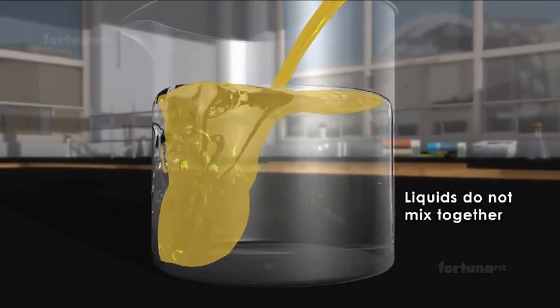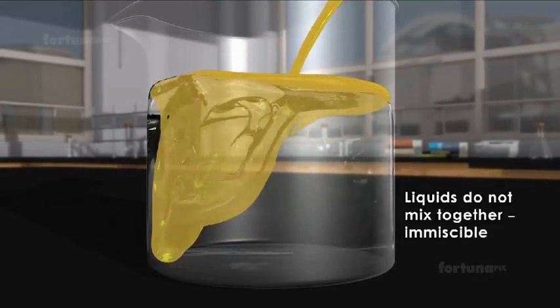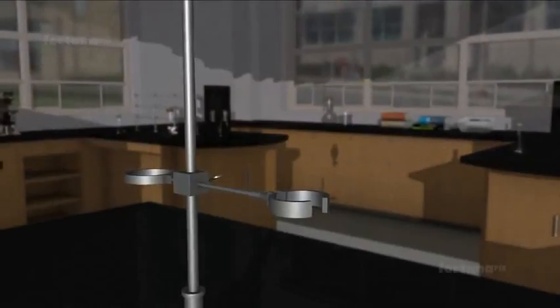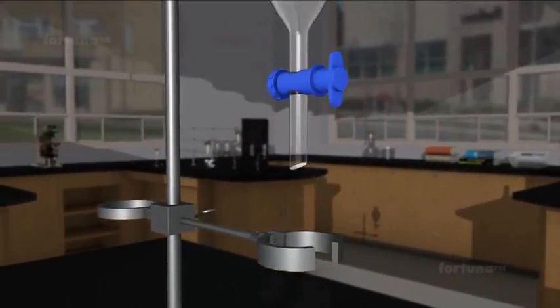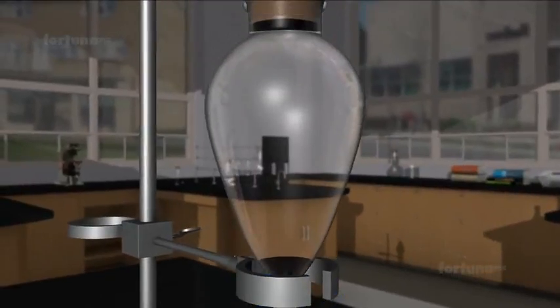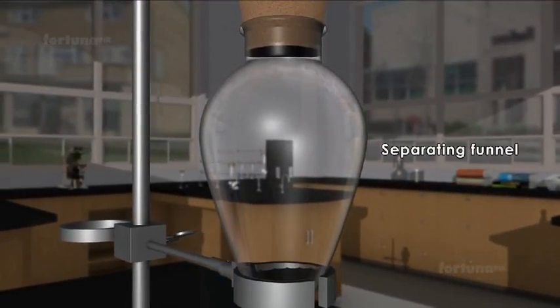and form a homogeneous mixture, we say they are immiscible. A mixture of immiscible liquids can be separated using special laboratory equipment called a separating funnel.